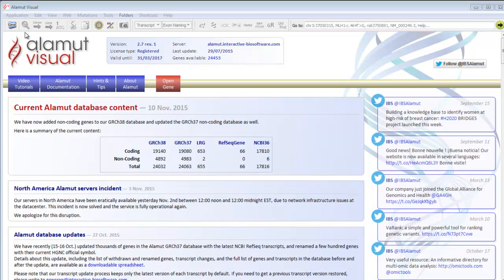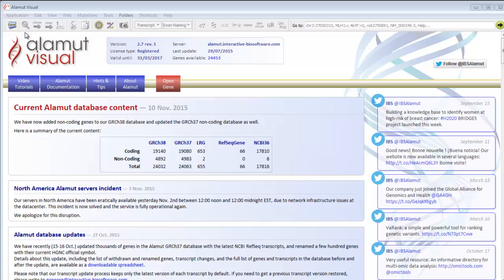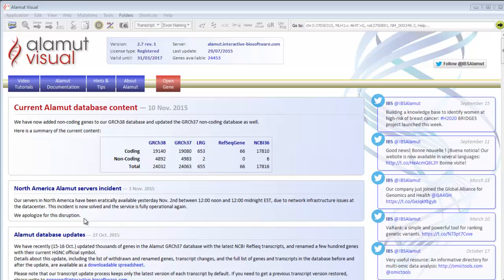On the home page, you'll find some information about your license, about the software updates, and any relevant information concerning Alamut Visual. Please visit this page regularly to be informed about the latest news regarding Alamut Visual.